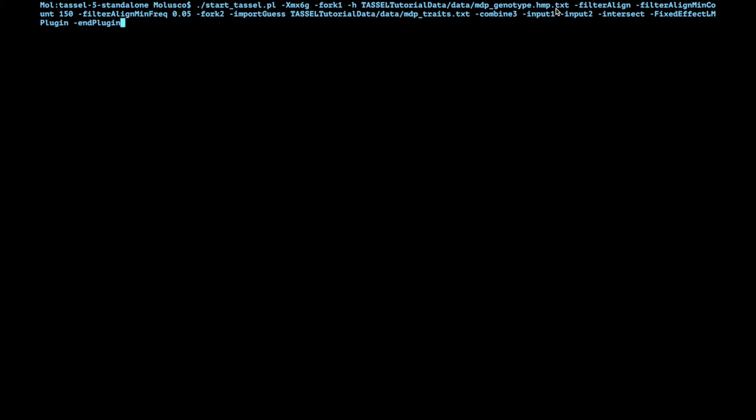And the first thing we want to do is we want to filter all genotypes. So we're going to use the option filterAlign. Now you're going to see sometimes it starts with non-capital and then the next one is a capital letter, that's a Java standard. In any case, so we're going to filter alignment and then we want to filter based on very simple criteria. So the first thing we want to look at is missing data. The option filterAlignMinCount means it's the number of taxa or individuals in which you have to see a genotype call. In this case we're setting it to 150 because that's roughly half of the individuals that are present there. So we're asking that at least half of them have a genotype.